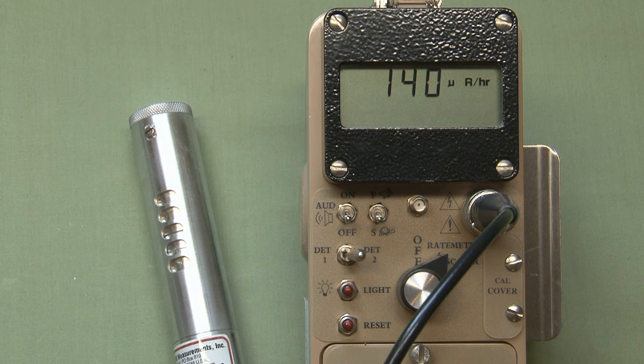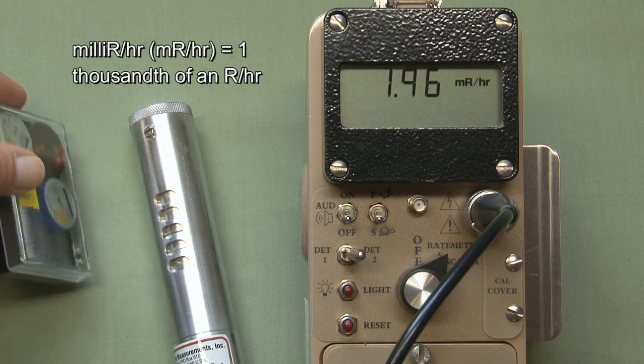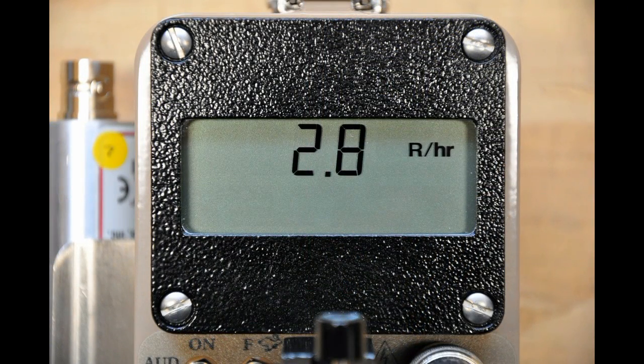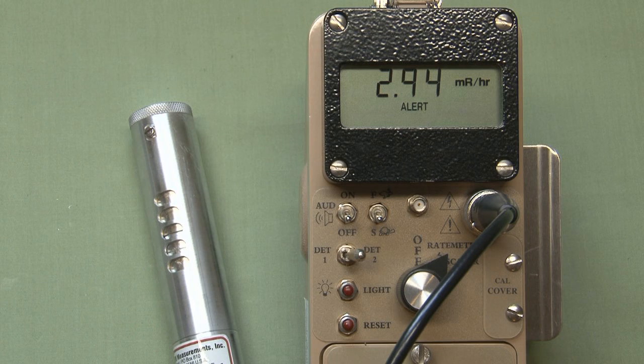The same auto-ranging capability seen in counts per minute also applies in dose mode. With a dose exposure rate detector hooked up, after resetting, you'll notice it starts in micro R per hour — the little micro symbol before the R per hour looks like a backward U. As I bring a source in, it auto-ranges to mR per hour. If the source were hot enough, the 'M' would disappear and the units would just display in R per hour. So it starts in micro R, auto-ranges up to milli R, and then eventually to R per hour.